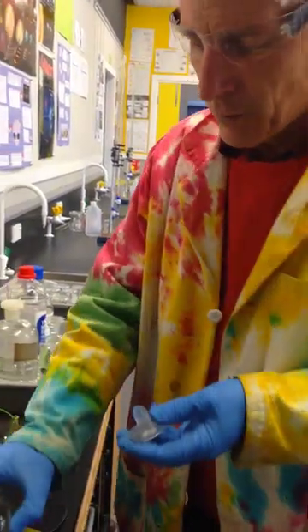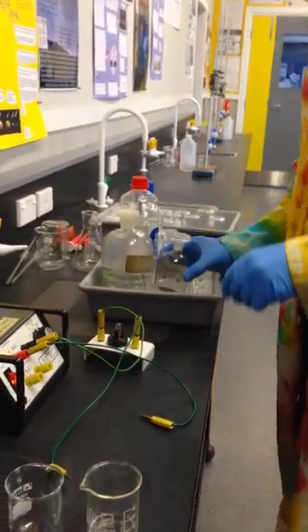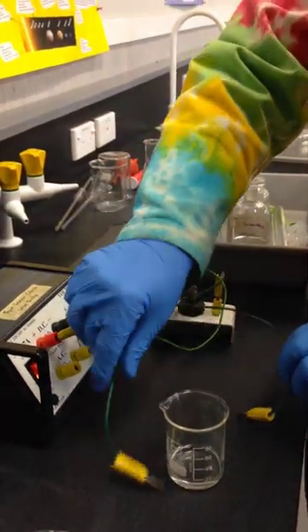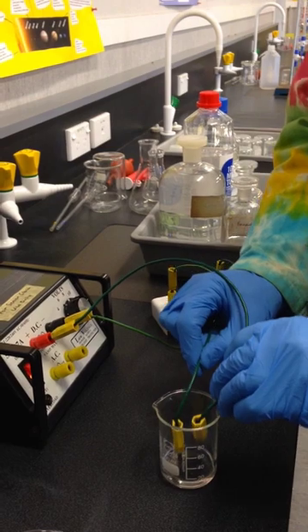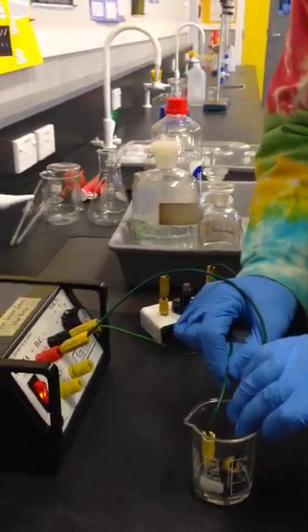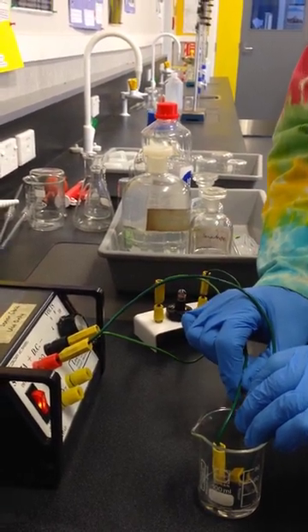So I'm just going to put a little bit of ethanol. I'm not going to put too much. I'm going to bring it over and put the ends of the leads in, and you can see that the light bulb does not glow. That doesn't surprise me.